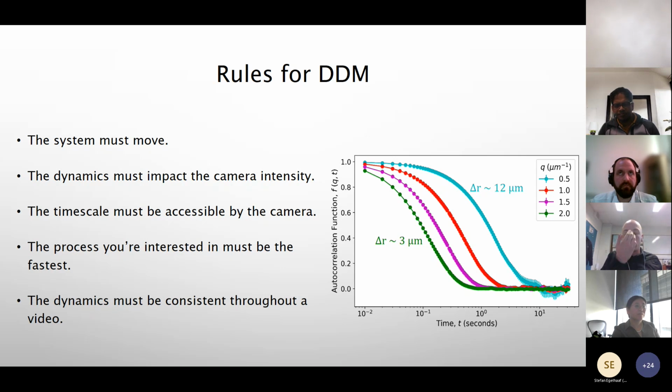But once you get to very small particles, your signal becomes very weak because they don't scatter much light, or they don't necessarily present as much of a signal to your intensity. So again, you've got a challenge of identifying these particles and being able to track the signal from them, being able to get enough of an impact on the intensity to get a signal. Does that answer the question?